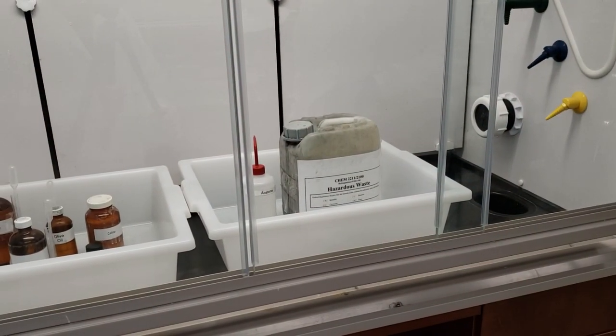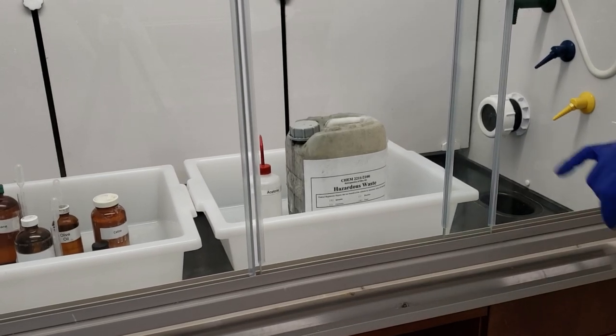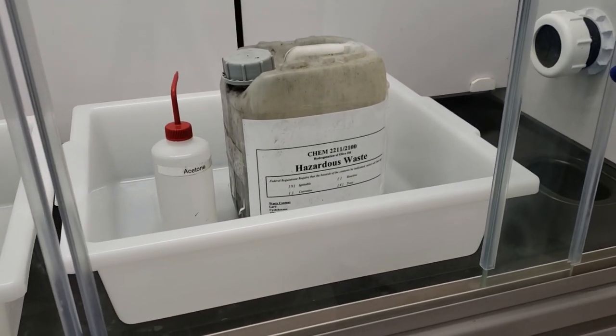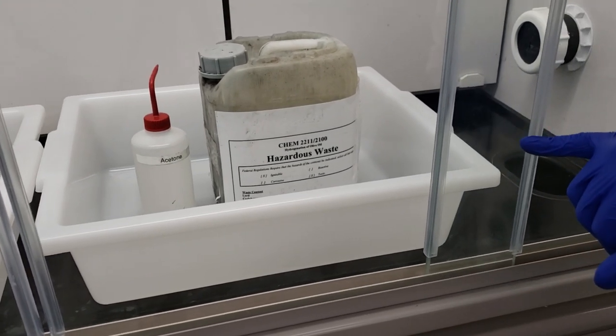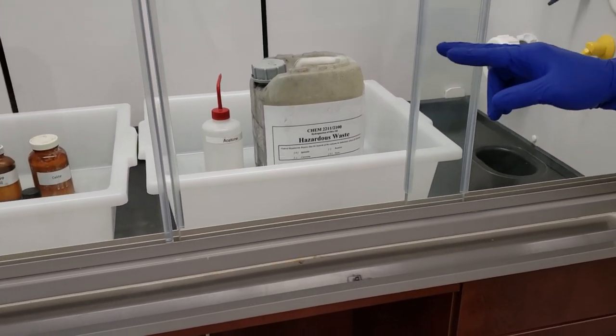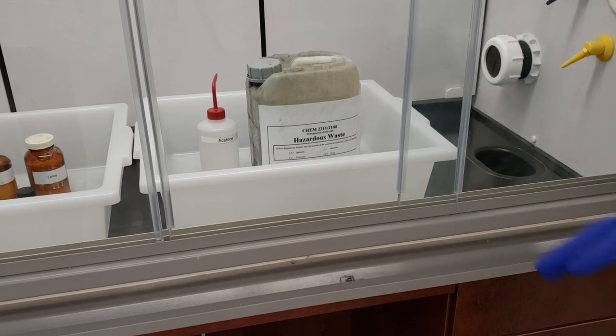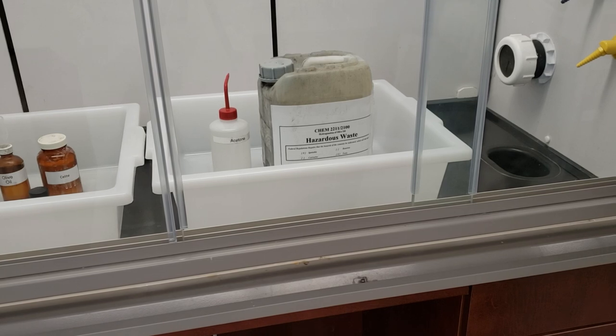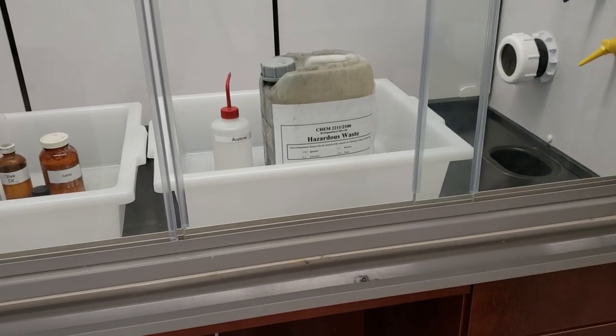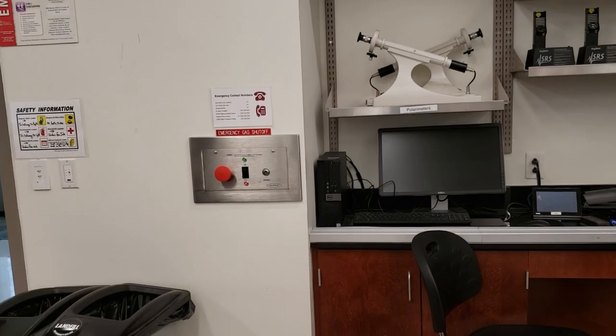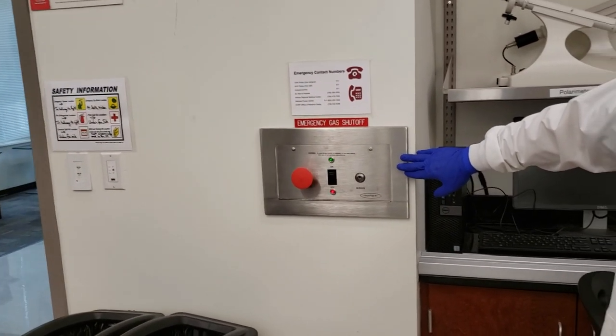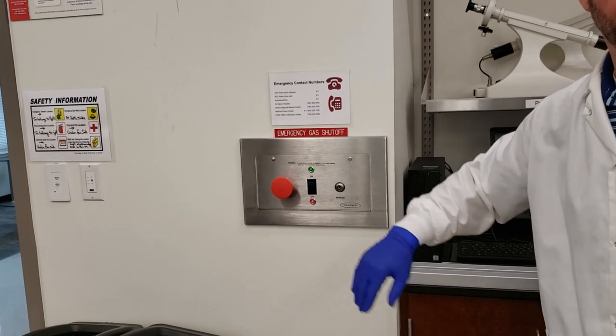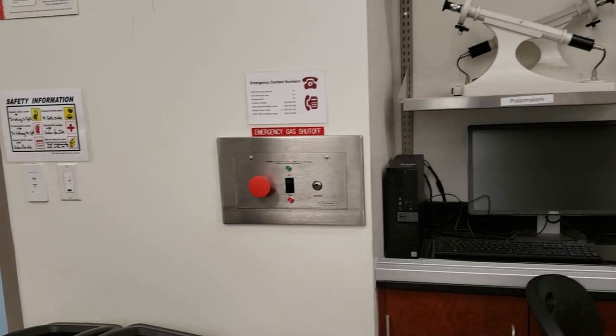For disposing of hazardous waste from experiments, we have specific labeled containers placed in each fume hood. For example, this is our hydrogenation of olive oil waste for 2211 and 2100. Any waste generated goes only into this bottle, including any acetone or water rinsings from cleaning glassware. Never rinse that down the sink. Last, we have our emergency gas shutoff at the front of the room, labeled obviously with a big red button. If we have a problem with the gas system, hit that to cut it immediately so everyone will be safe.